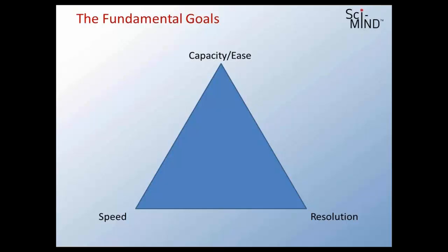That means maybe I'm just going to use a really, really long column in my standard instrument to generate the resolution. What we're going to find in our method development exercises is that what we really end up doing, or starting with, in industry is some compromise between those goals. Most of the time when I'm consulting with people, I tell them, okay, we talk about these goals, I can give you two of them and I can do that pretty easily. But if you want all three, that's an extremely difficult problem and is going to involve compromising some of them. So that's a goal to start with.